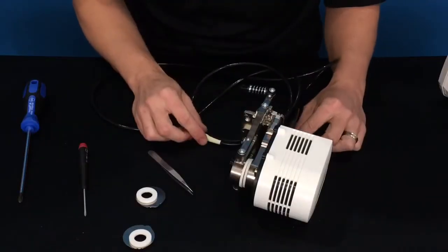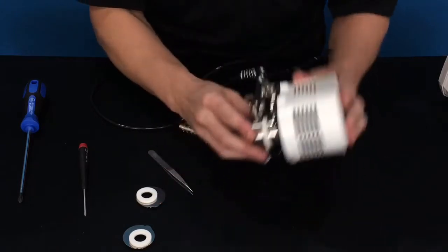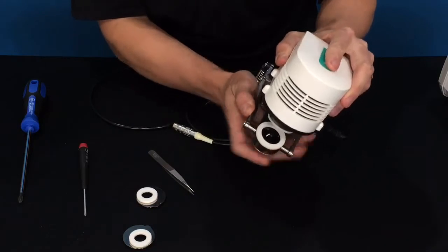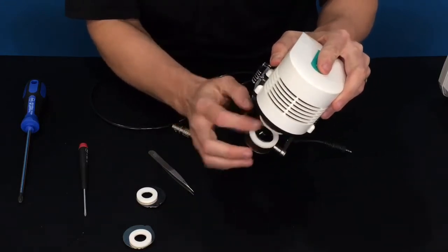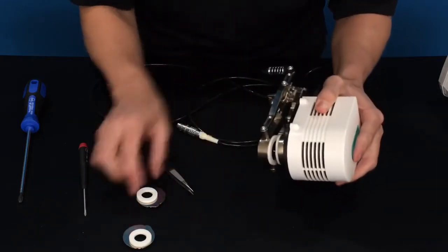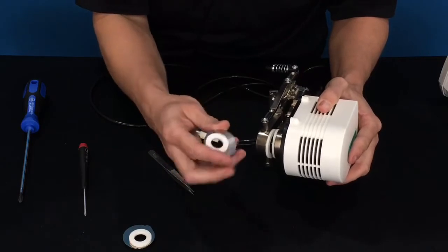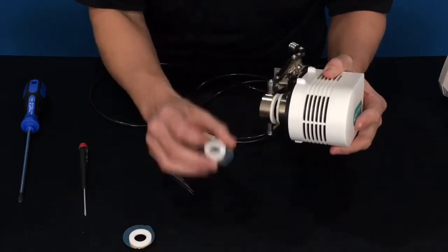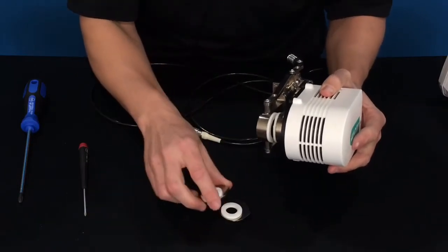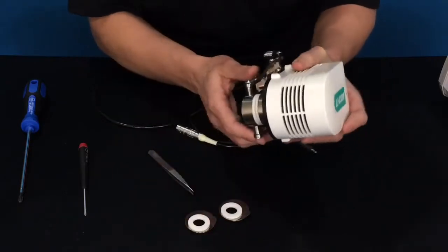We're going to start by discussing the two aperture sizes available for the LI6100A fluorometer. Installed currently is the larger aperture, which is six square centimeters of leaf area. If you'll be working with smaller leaves, you may want to use the smaller aperture, which is two square centimeters. Both the top and the bottom need to be replaced when switching between apertures, so we'll go ahead and install these to demonstrate that.